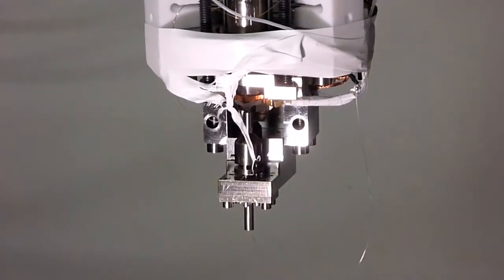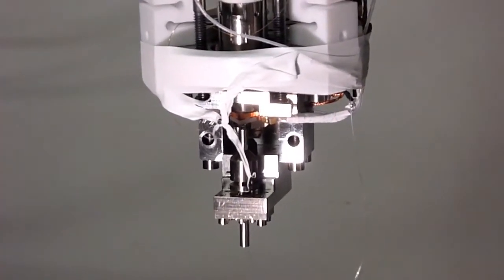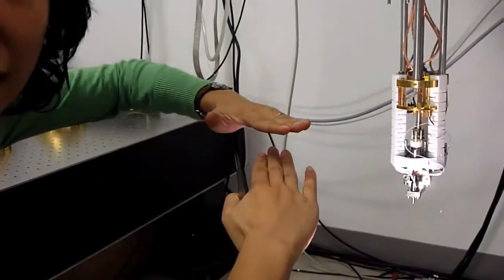So basically, we're in the configuration that here is the sample, and the tip goes like this. And we scan while the sample moves, and the tip keeps static.